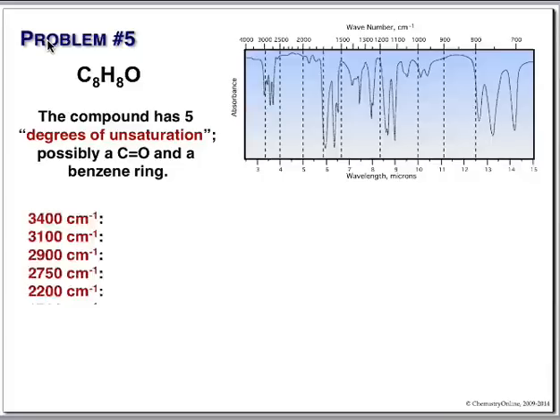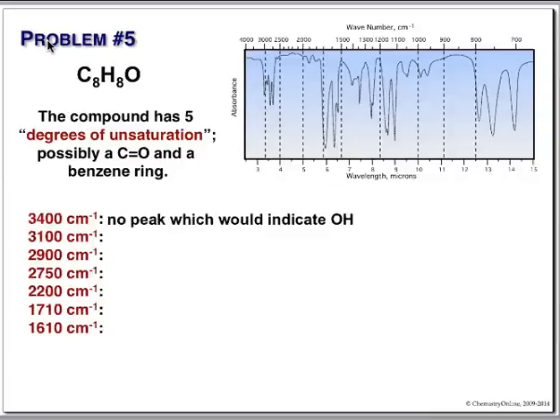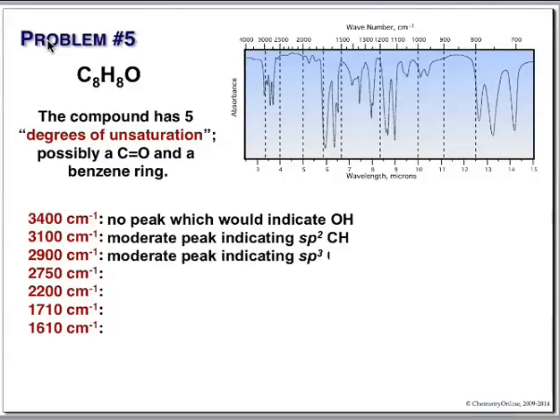All right, 3400, do we see anything? Nope, not at all. 3100. Nice sharp peak right here, just on the high side of 3,000. 2900, yep, we got it, 2900. Now, what in the world is this at 2750? Finally, we get to see a real aldehyde.